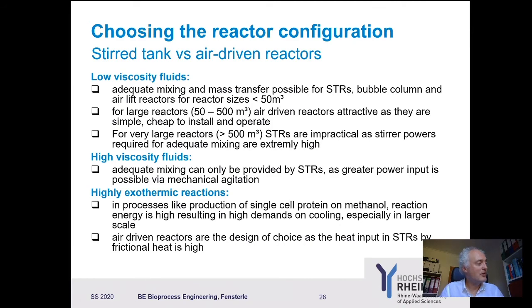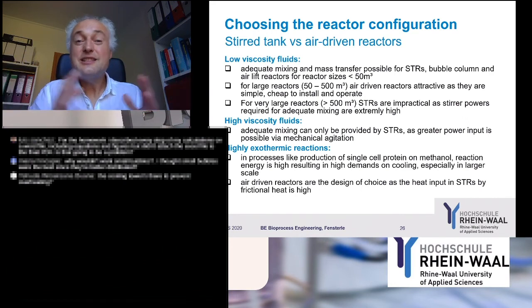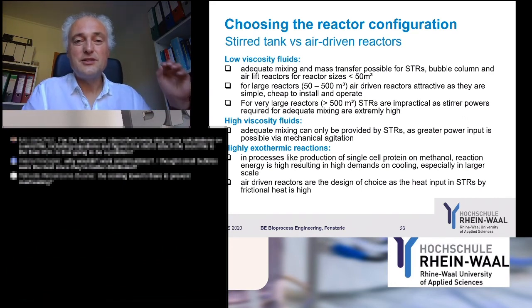And now we have a look back to the question. Yeah, the cooling tower is there to prevent overheating. It's for cooling the bioreactor, because initially, remember, they were constructed for growing on methanol, and methanol, you remember, is highly reduced.